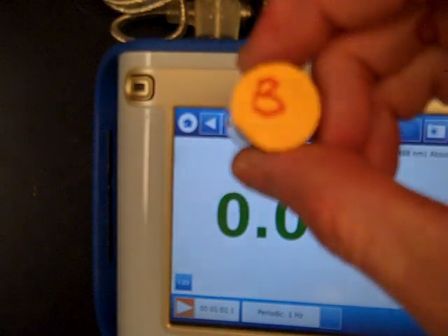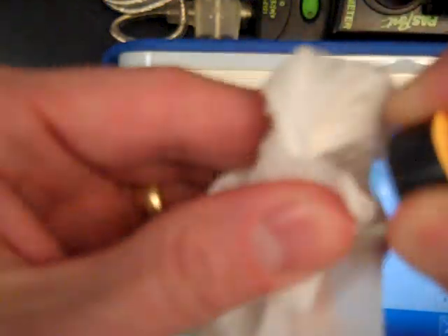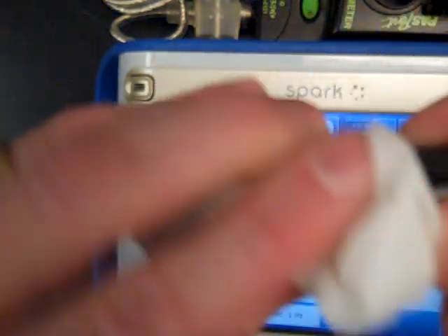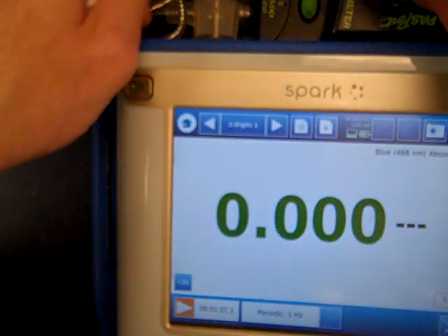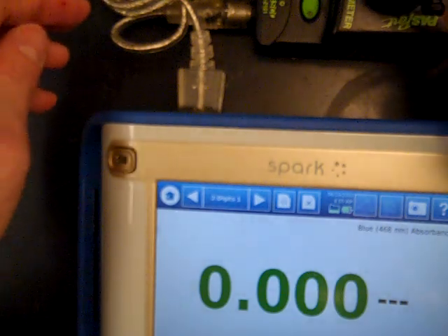We take the blank sample, wipe down the outside with a chem wipe to remove fingerprints, and place it inside.